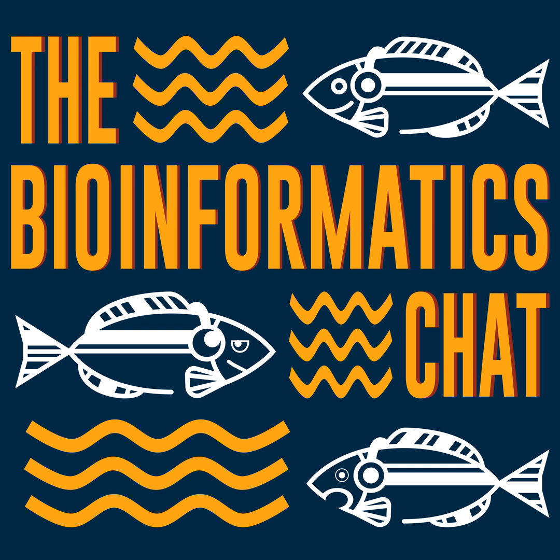disjointigs are sort of similar to contigs, and the idea is that you can build these disjointigs really, really fast, and you will cover your entire genome with them. Then you can build your graph and compute pairwise alignments of these disjointigs. But instead of working with the whole set of reads, you will only be working with these disjointigs, so your search space will be reduced significantly. So do you want to explain what a contig is for those who don't know?